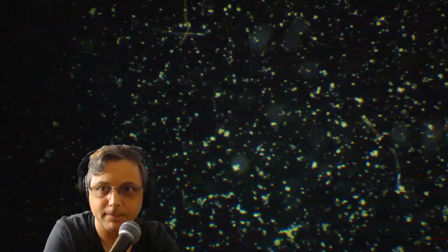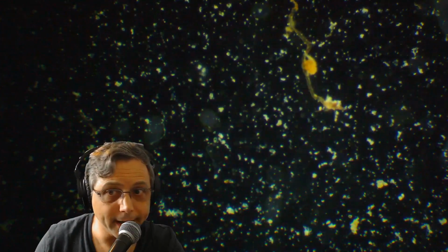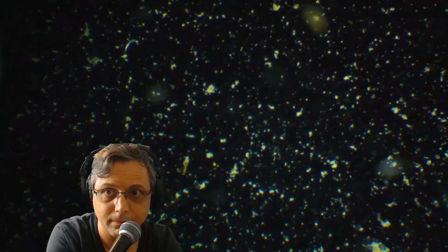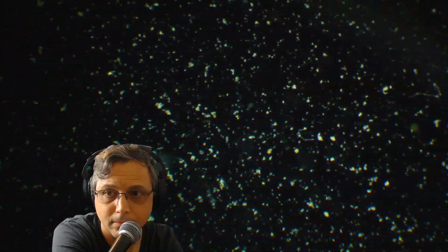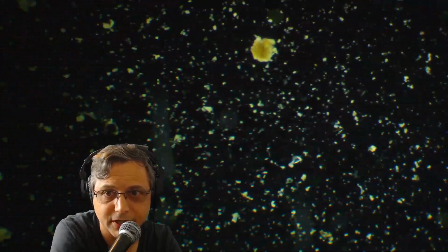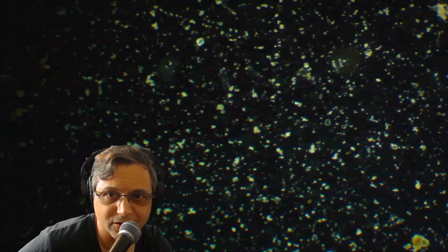Focus. I expect worms in here. I expect to find worms. So far, not a whole lot, huh? Okay, let's go down. Just gonna do the lawnmower technique here, where I sweep across.